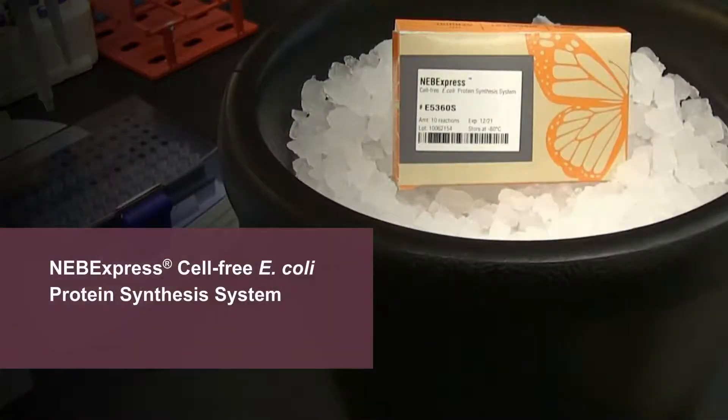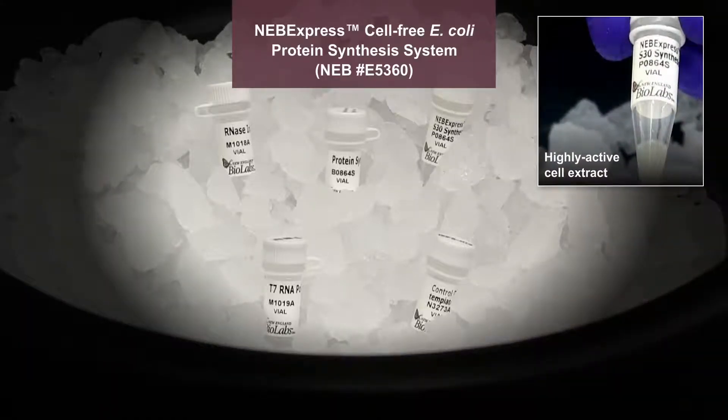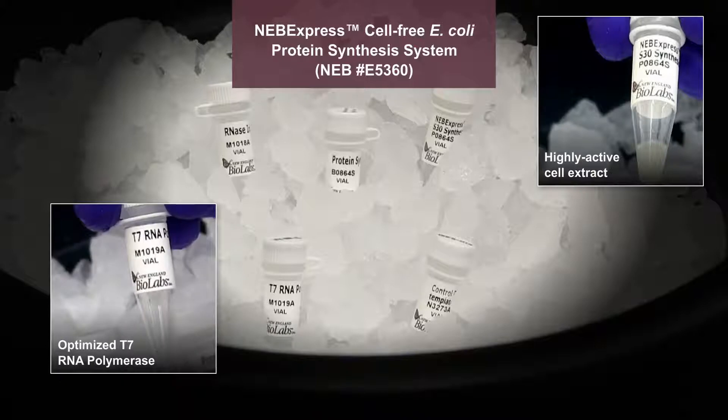The NEB Express Cell-Free E. coli Protein Synthesis System can synthesize protein in just 2 to 4 hours. This system includes all of the components needed for protein synthesis: a highly active cell extract and an optimized T7 RNA polymerase.